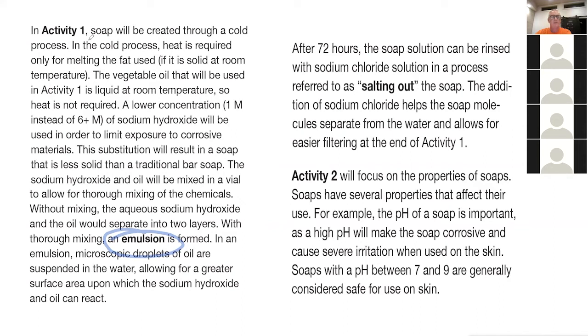So when we shake this up, we're going to form an emulsion. What does that mean? It's like a suspension. And a suspension just means that we're going to form really, really small droplets, because if you take water and oil, they don't mix, right? The oil should float on the top because it's less dense than water.